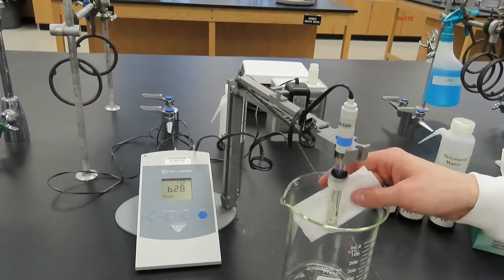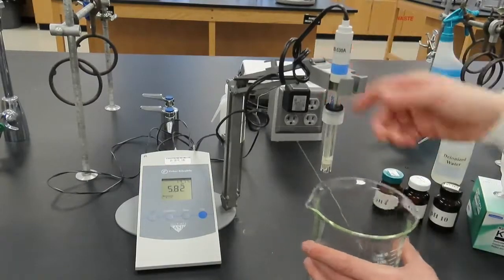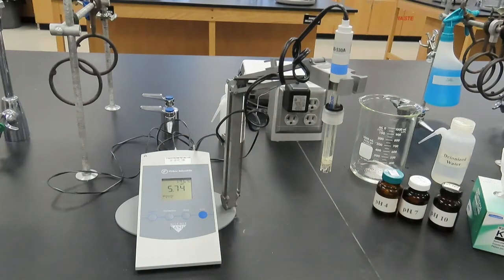What can we conclude from the pH readings of these three unknown solutions? Solutions A and B may be the same solution because they had essentially the same pH, but solution C is definitely a different solution from solutions A and B because of its much higher pH.